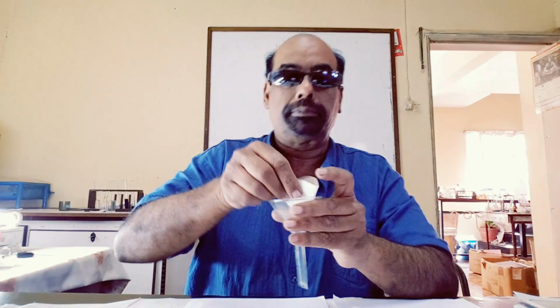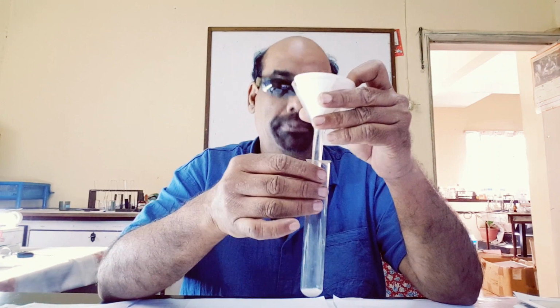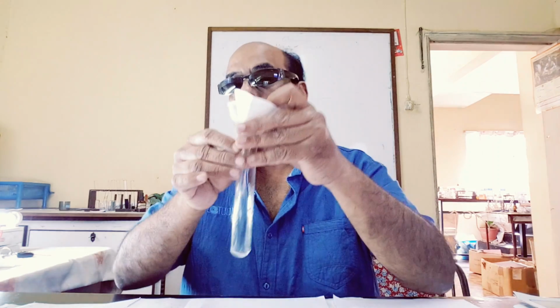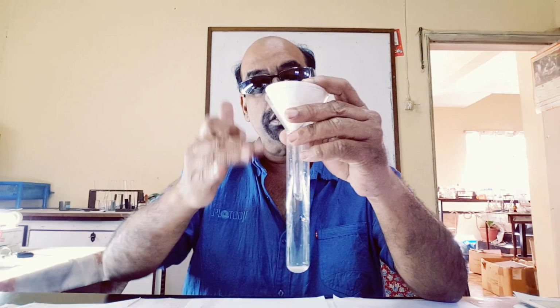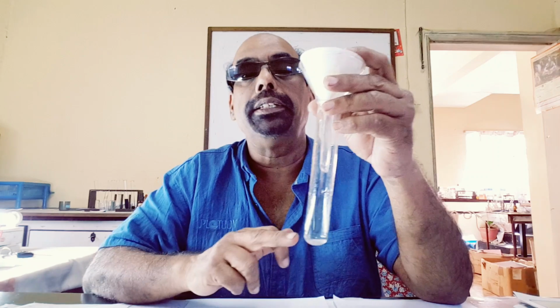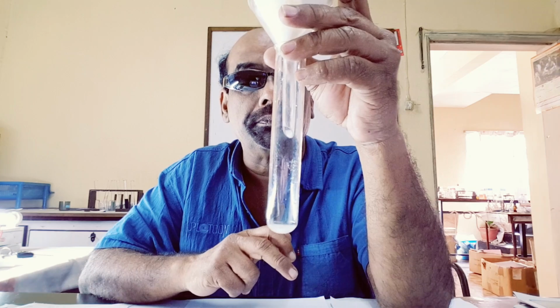We place it in the funnel, then we place a receiver, a boiling tube, at the bottom. Then we pour the mixture above the filter paper and allow it to pass through the filter paper and be collected in the boiling tube.